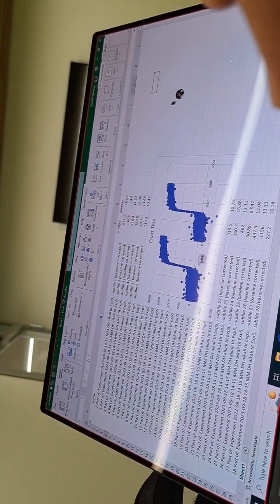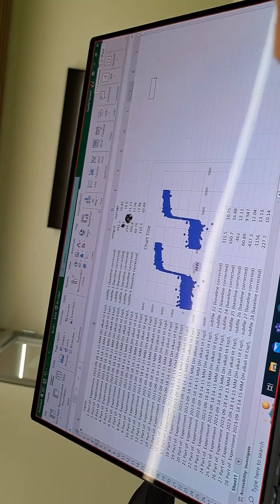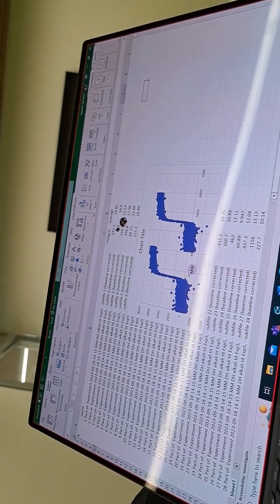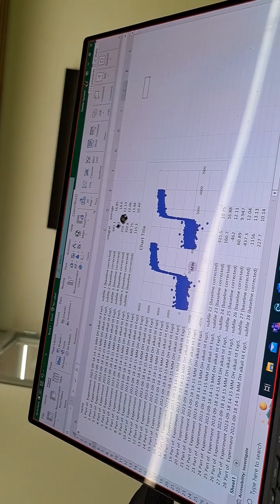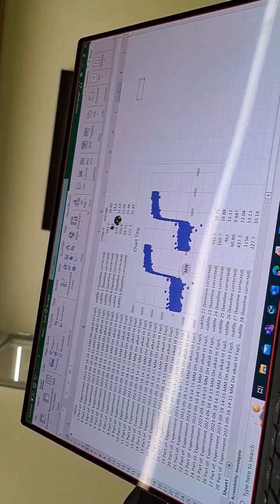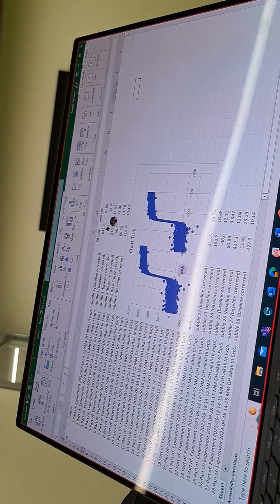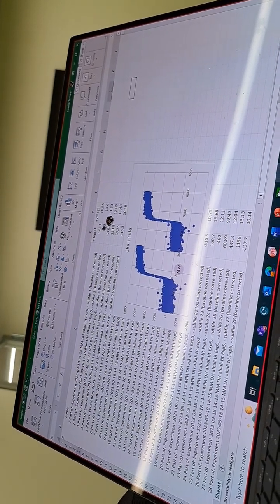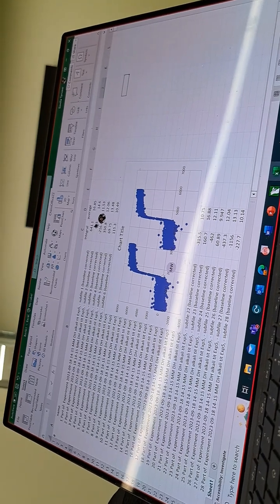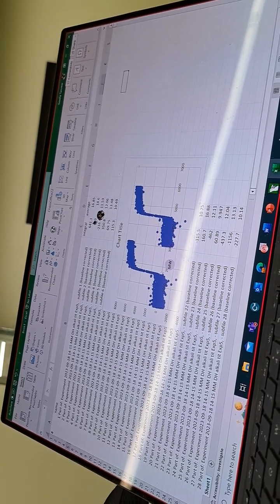And then I shall plot these integral areas against the pH. Am I right? It depends what you want to show. You can correlate, but you'll need a pH measurement for each spectrum. Yes, you need to correlate them and make sure they reliably correlate.